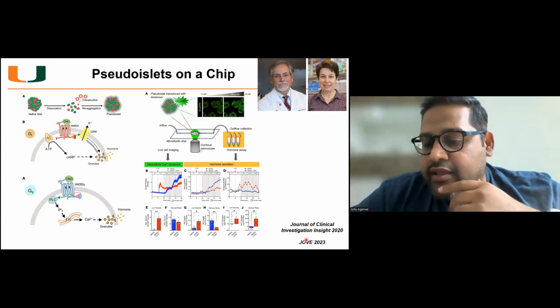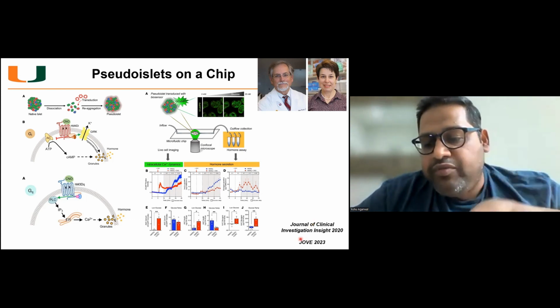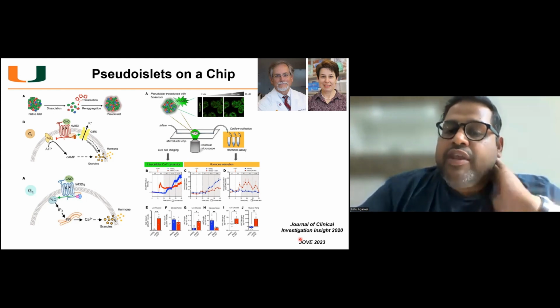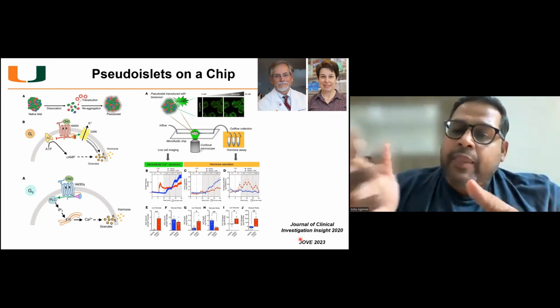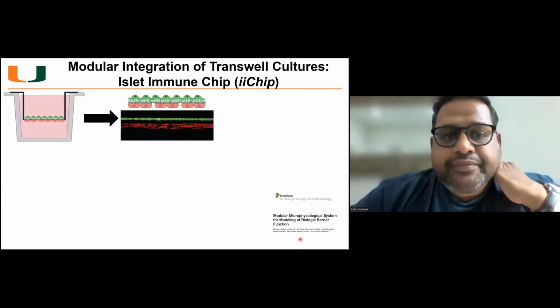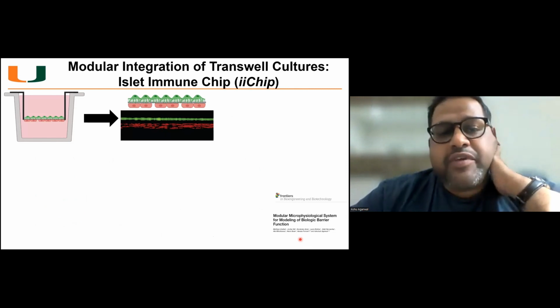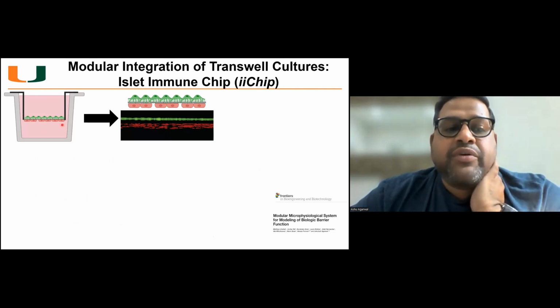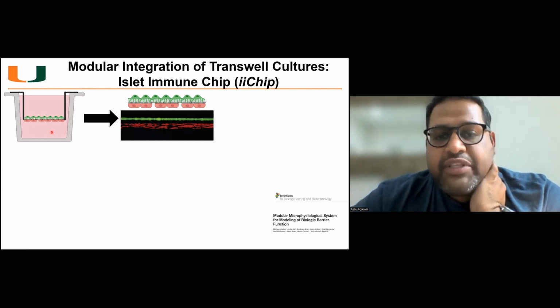And then their lab actually published a very beautiful JoVE paper, Journal of Visualized Experiments paper, last year, where you can actually see the assembly of the device, but also the use of the device. So for the current version of the grant, where we have to study islet-immune interactions, we took the same design philosophy of using PDMS-free plastic devices and actually maturing these barrier functions. For example, endothelial cells, you could have epithelial cells in there.